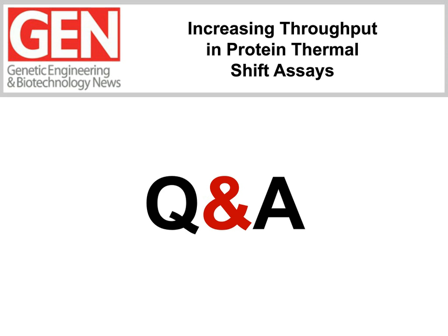But that can be determined pretty easily when you do a matrix of the dye concentration versus your antibody concentration, and it would not take more than 10 minutes of your time to get that done. All right.